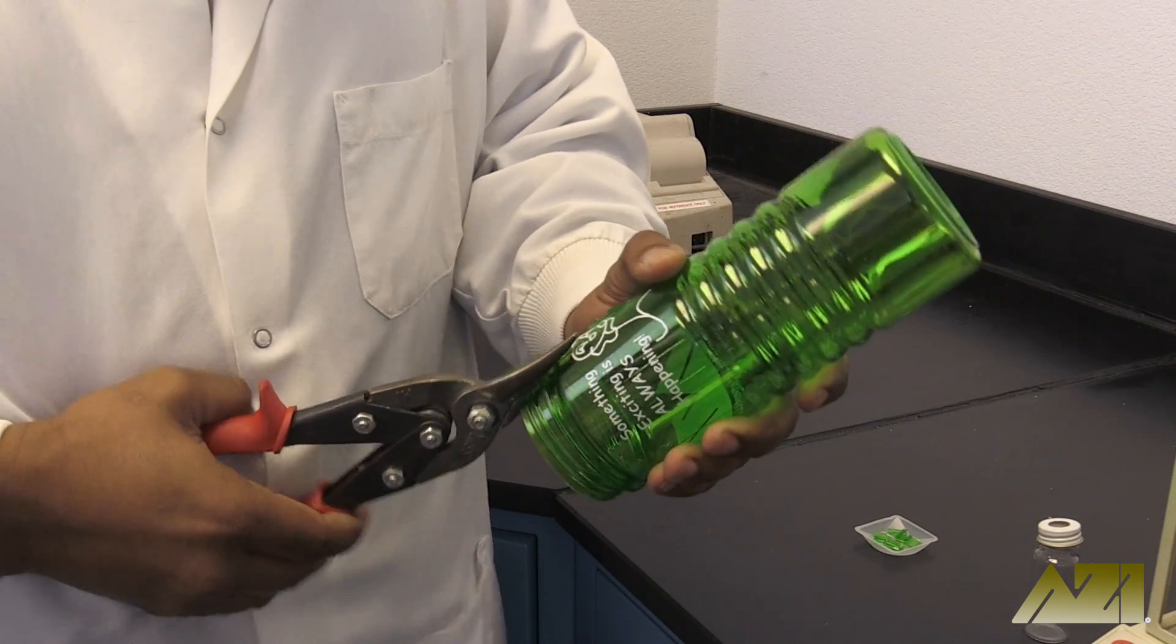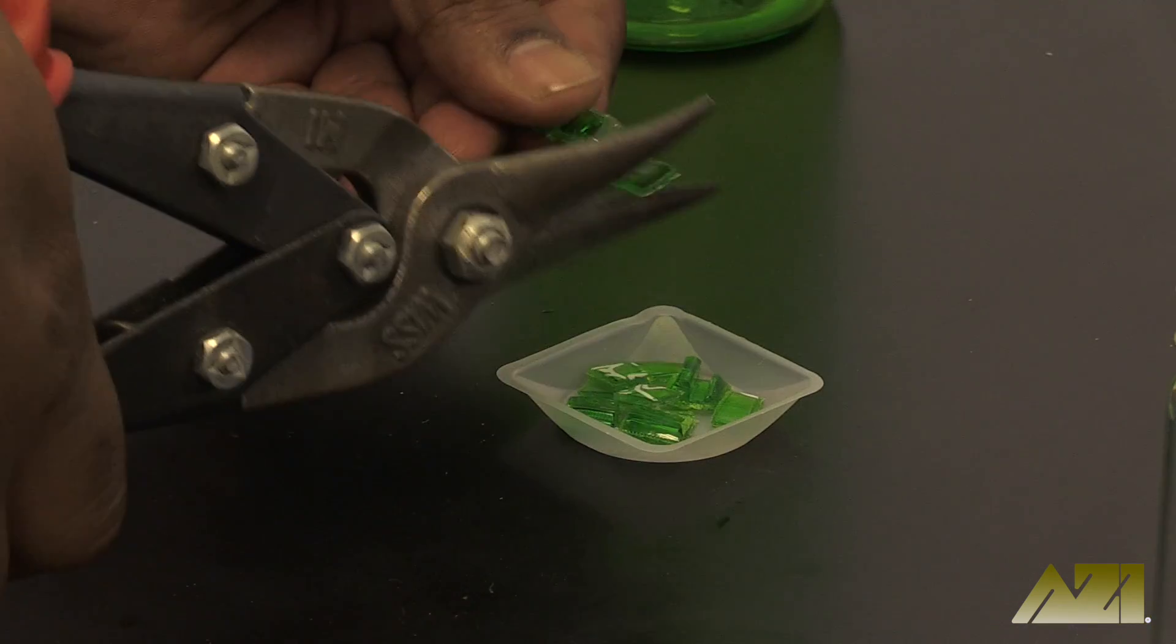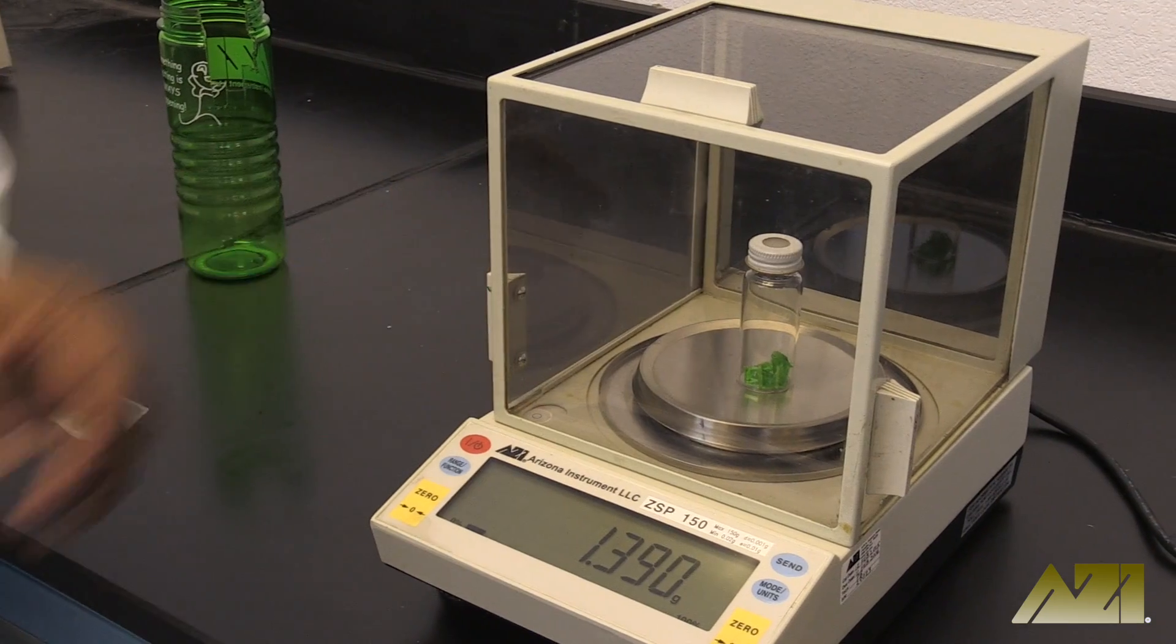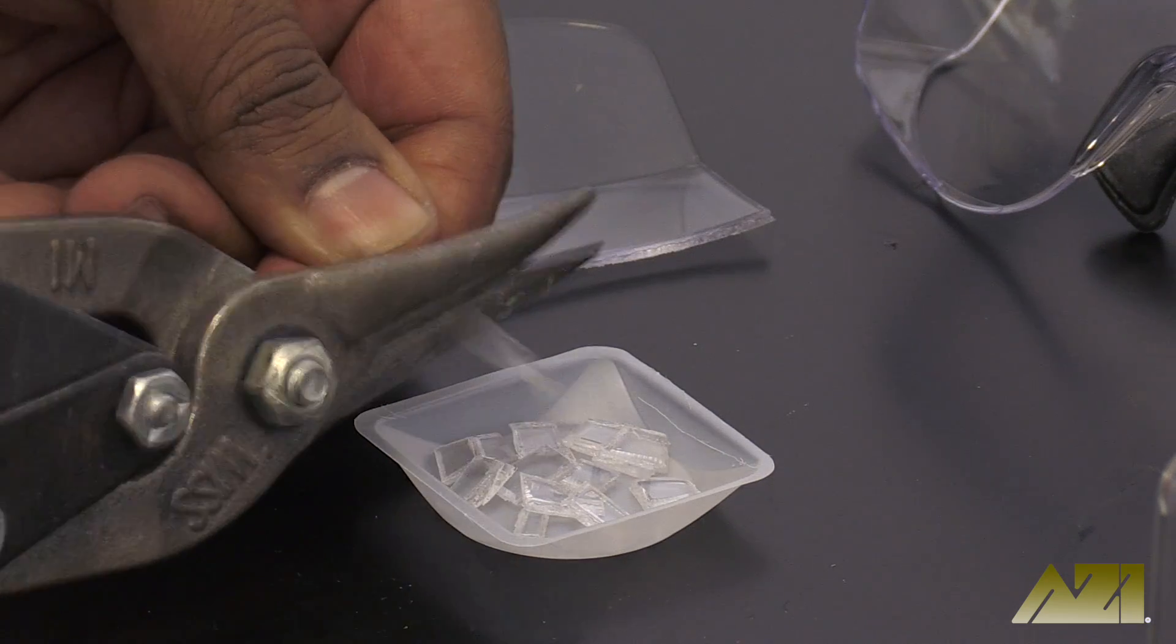From water bottles to safety glasses, souvenir shot glasses to office supplies, polycarbonate products are all around us and moisture testing is necessary to create all of them.